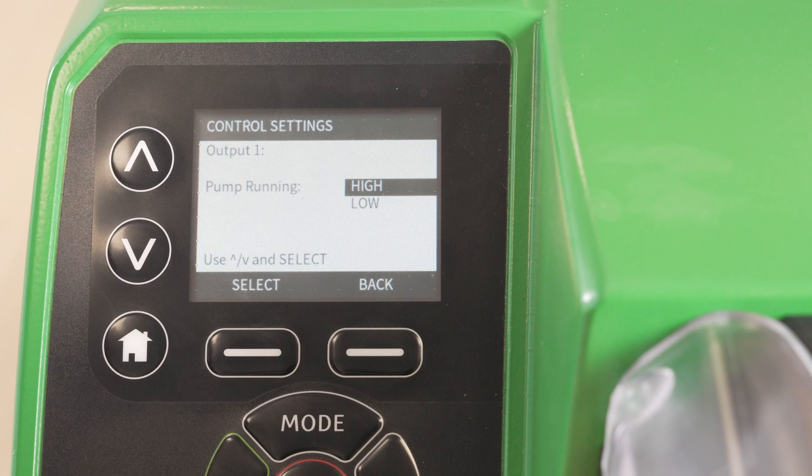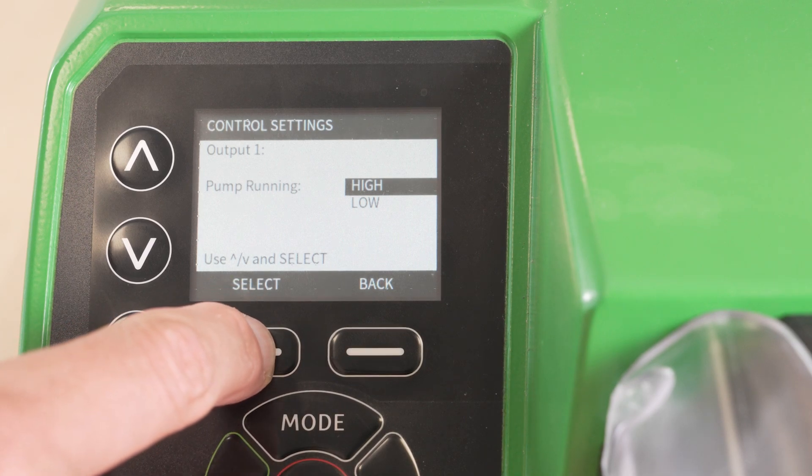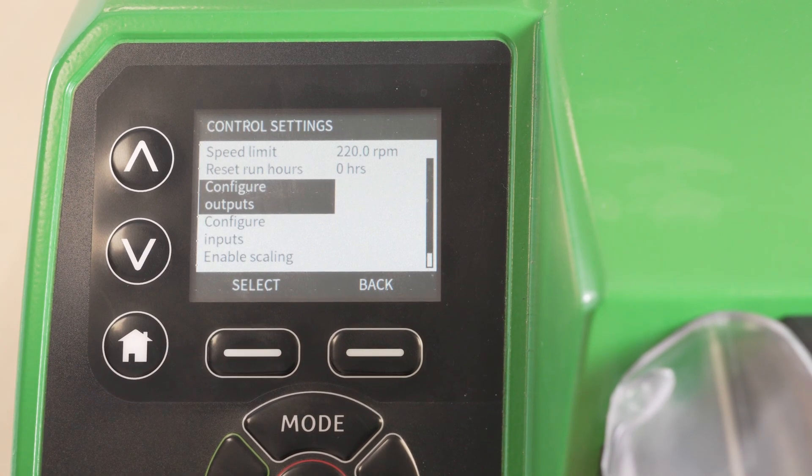Choose your output sense. In this example we are choosing pump running equals high. The output sense refers to the status of the output signal when it is signalling the activity of the control condition you have selected. In this example we are selecting for the output sense pump running and we leave it set as high.